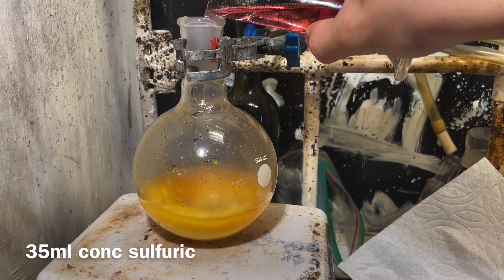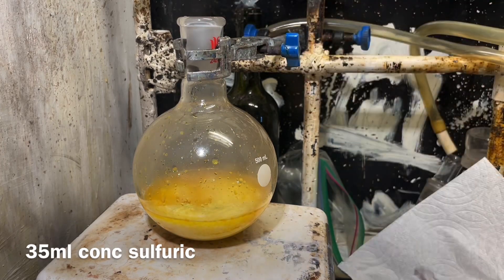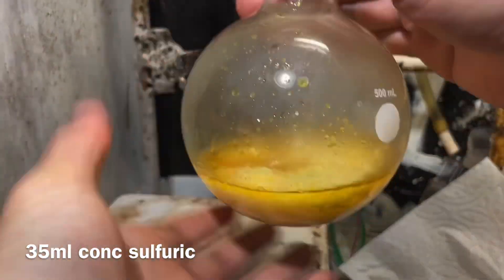Now we're going to add 35 milliliters of concentrated sulfuric acid. It's going to form aniline sulfate, so it's going to clump up really. A stir bar is really useless for this.